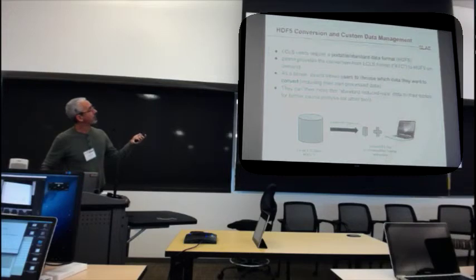I'll just briefly say, we do this standard HDF5 conversion from this XTC format. We have this ability now where you can choose which data you want to convert into HDF5. So you can take your big LCLS data, translate it with the Psana HDF5 translator, and choose what you want, including adding your own data there. Maybe you make it small enough so you can put that data on your laptop and you can analyze it with Psana Python on your laptop.